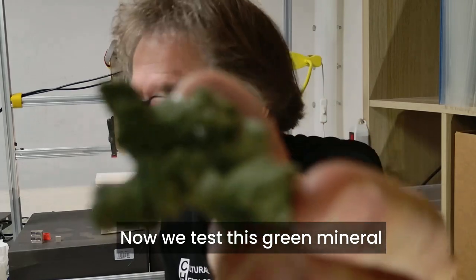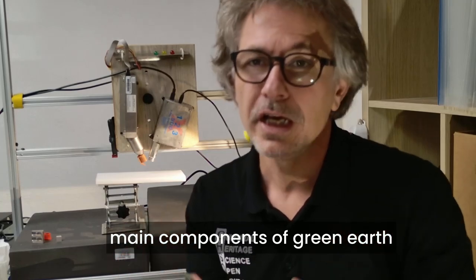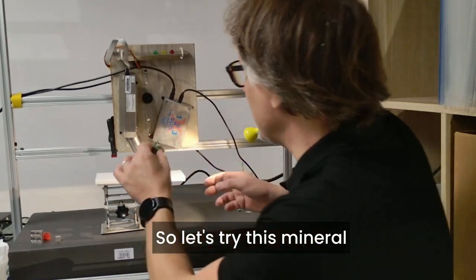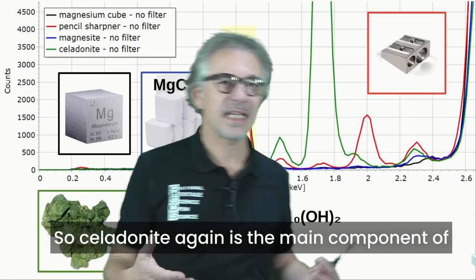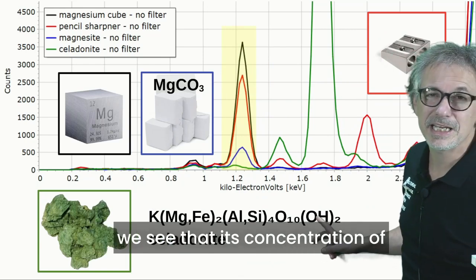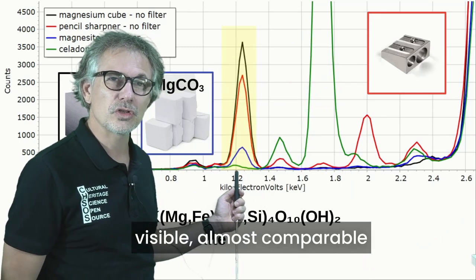Now we test this green mineral. It's called celadonite. It's similar to glauconite, and these minerals are the main components of green earth. These are pigments that have been used forever in art, from antiquity to recently. It's found naturally. So let's try this mineral. This one is the peak of celadonite. Here from the formula of the mineral we see that its concentration of magnesium is much less. Consequently, the peak of magnesium is basically undetectable, barely visible, almost comparable to the background.